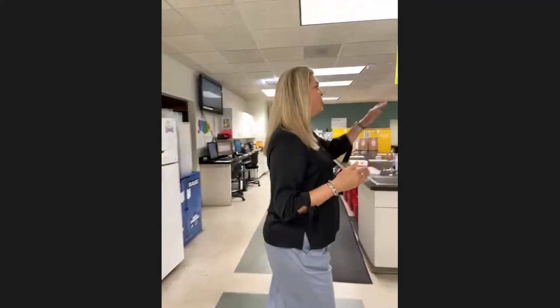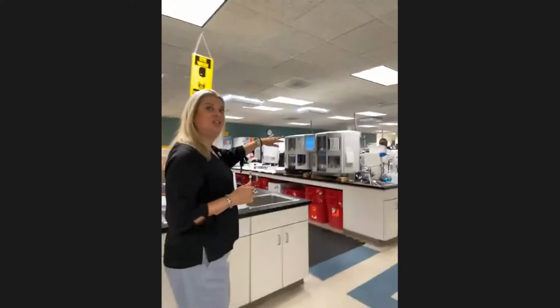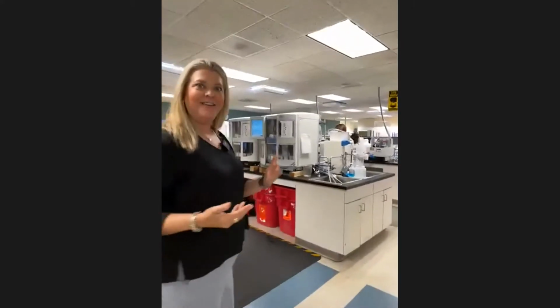Okay, so like you mentioned, he's putting that tissue on the slide, and we will do that for, like you said, 15 to 17, 18, sometimes more slides that we are going to put stains on. So they put the tissue in some racks, and they'll bring these racks over to these machines. These are staining machines, and they kind of do the work from there. They do the rest of it.